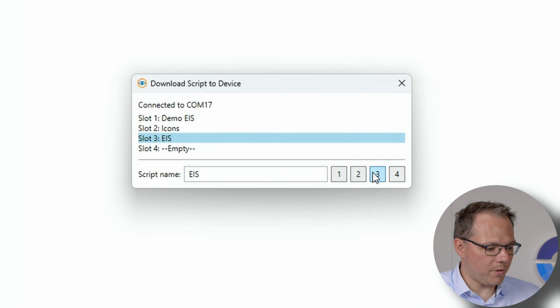Since you did perform it on the EmStat4T, it is also saved on the EmStat4T. Let's have a look how you get to this data. I close this visual methods editor. And again, here a warning, when you close it, it will not save this script in the visual method editor. If you want to have it in this visual way saved, go to File and save it there.